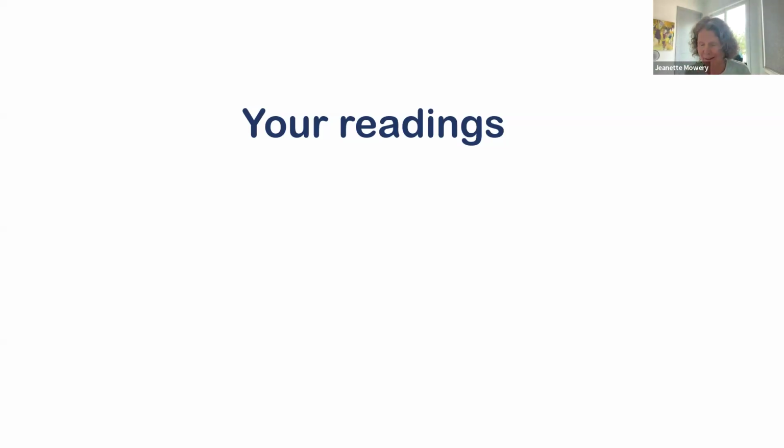There is actually ranging on the blue, from 21 by itself to 22.5. There is variability on the red side, mostly in terms of how many figures. There are some people that just had 23, and a lot of people had like 23.0, 22.8, 22.5. So there's still variability, and yet we still don't really know the exact temperature of the water. That's really cool.